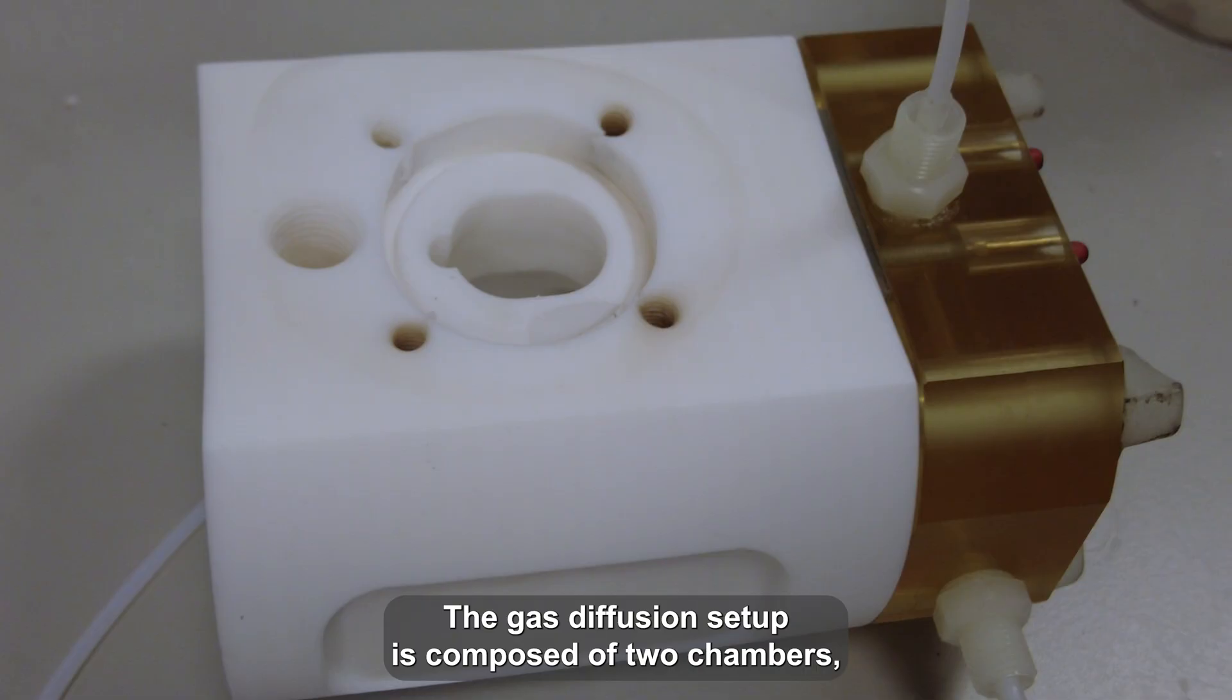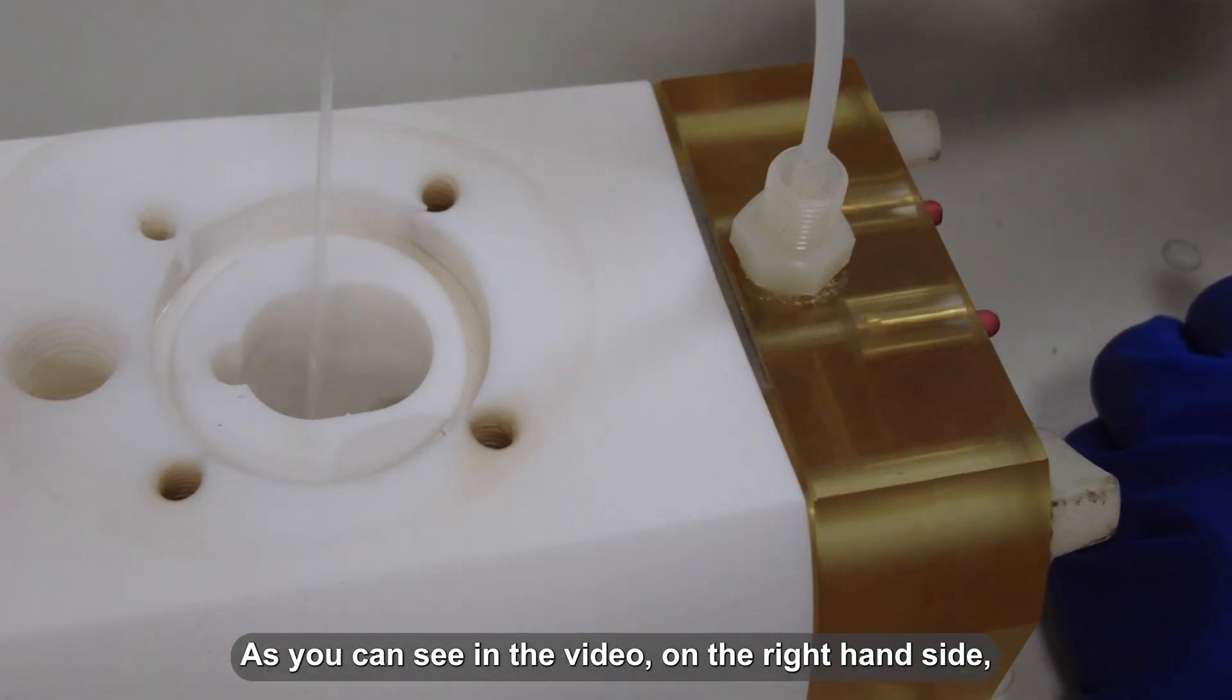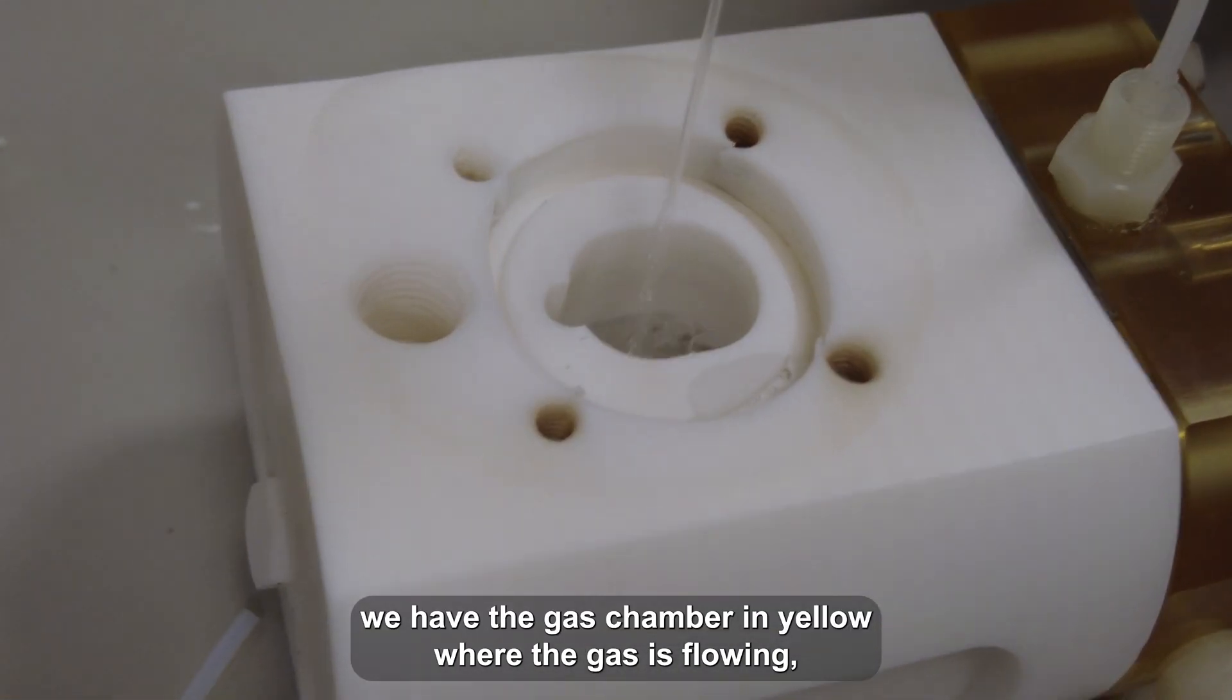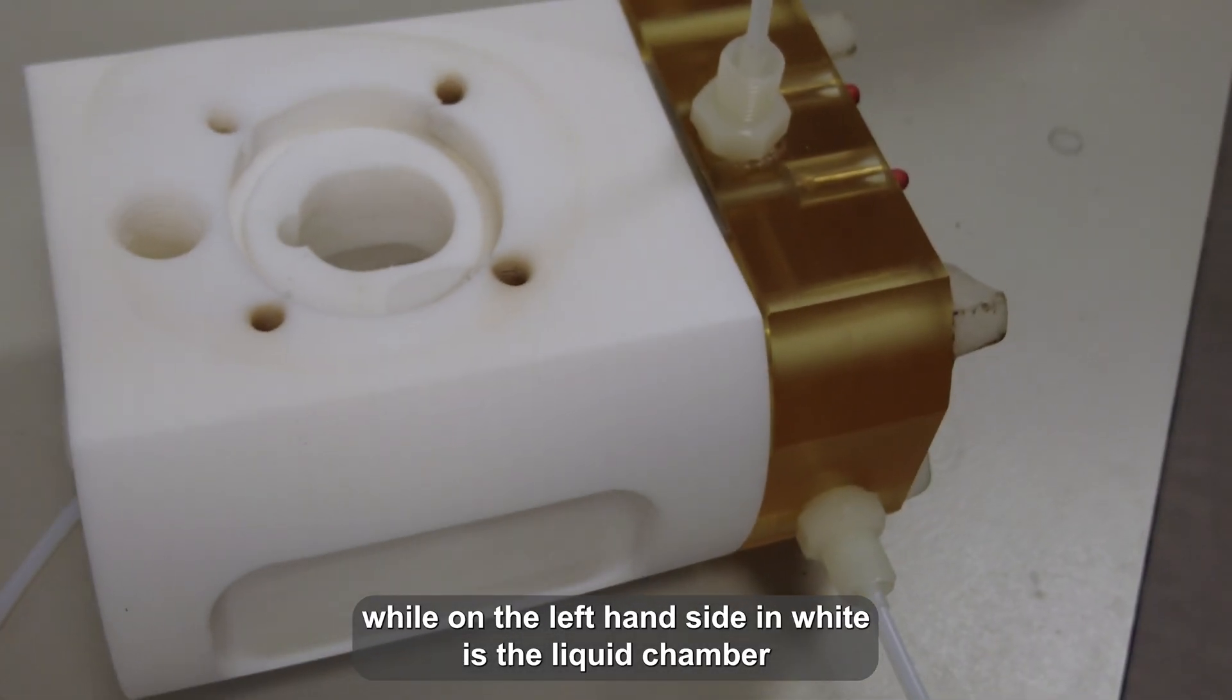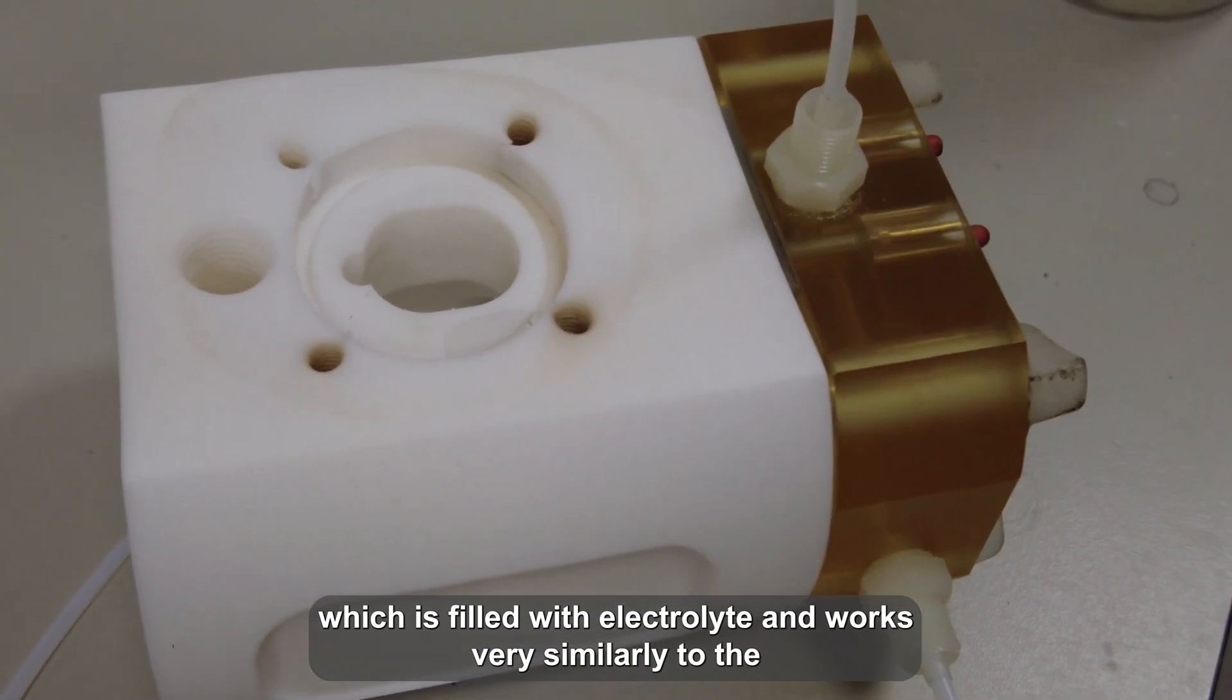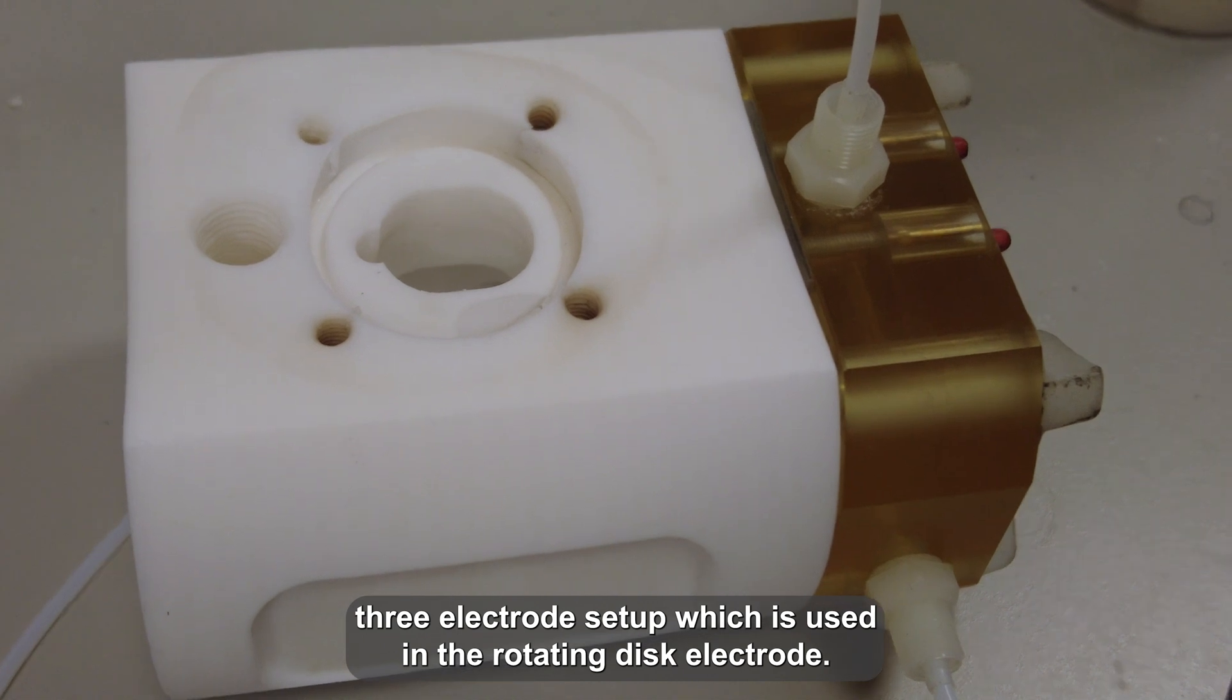The gas diffusion setup is composed of two chambers separated by the working electrode, which is the catalyst-coated carbon paper. As you can see in the video, on the right-hand side, we have the gas chamber in yellow where the gas is blown, while on the left-hand side in white is the liquid chamber, which is filled with electrolyte and works similarly to the three-electrode setup used in the rotating disk electrode.